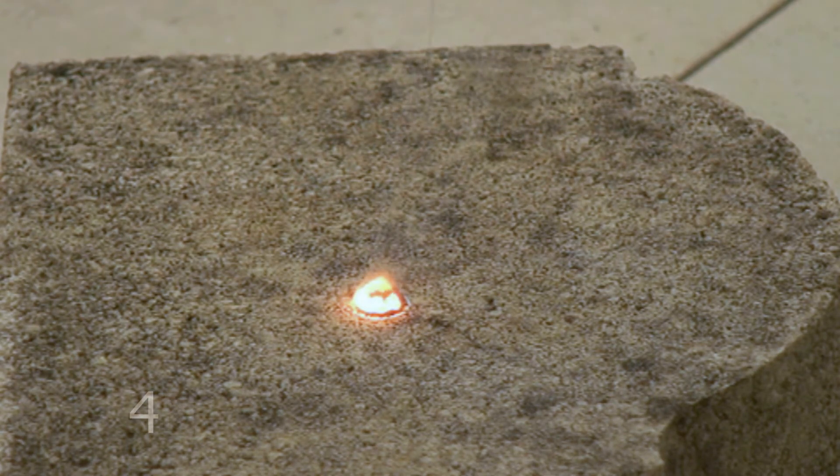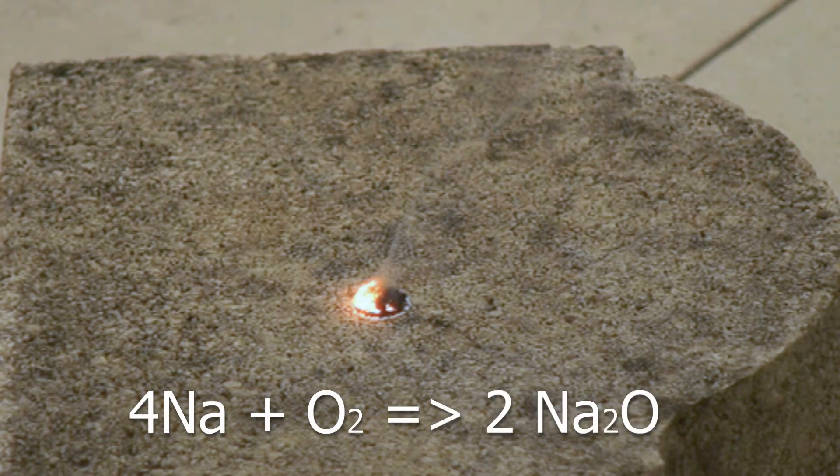The reaction produces sodium oxide, and you can see it being produced from the flame as white smoke.